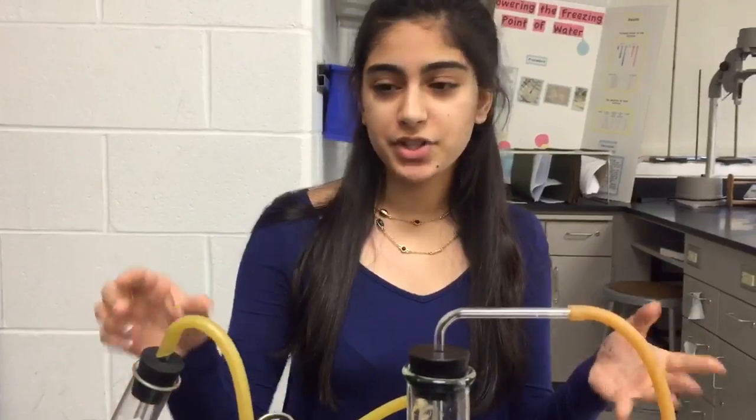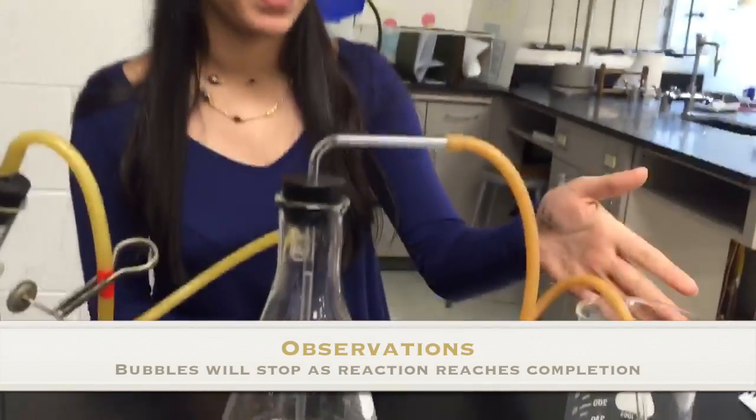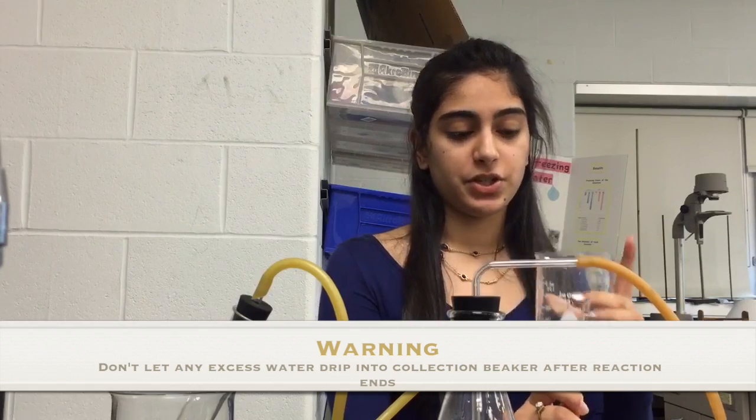As the reaction proceeds, watch as the bubbles subside in the test tube and water fills up in the collection beaker. Make sure that the water is filled enough so it doesn't drop below the tube level. When the reaction has fully completed, take the rubber tubing out from the collection beaker and make sure no excess water fills in, as that would count as excess volume.